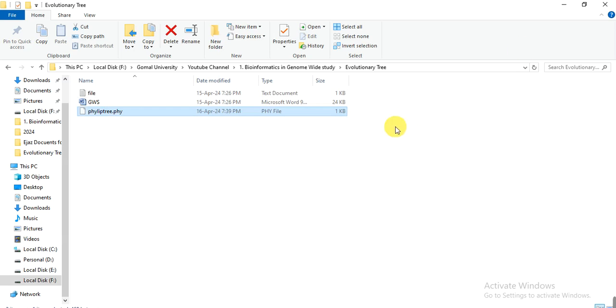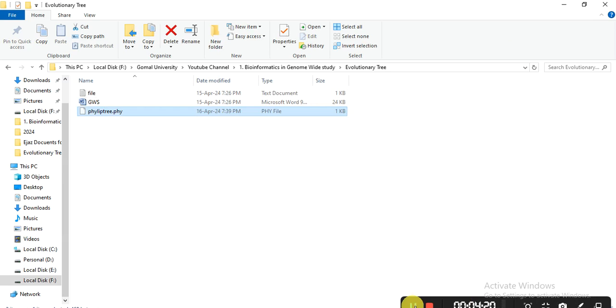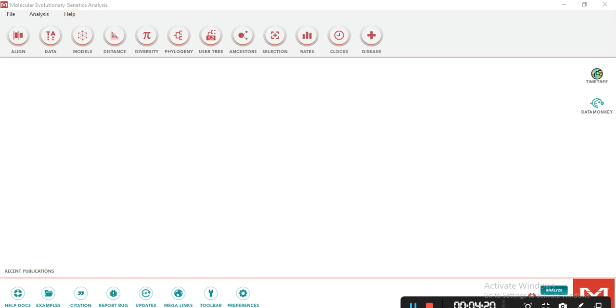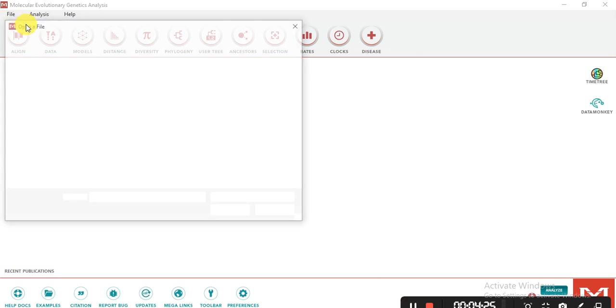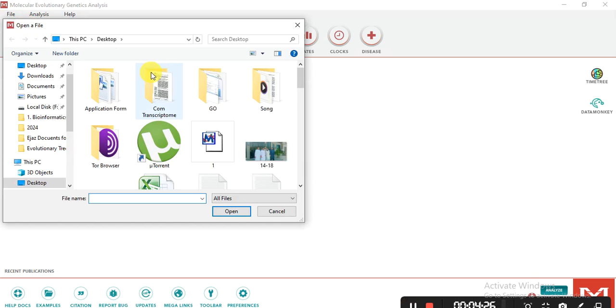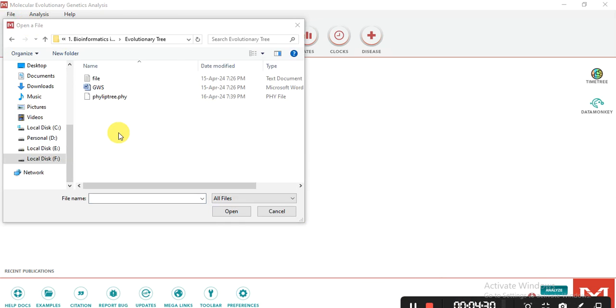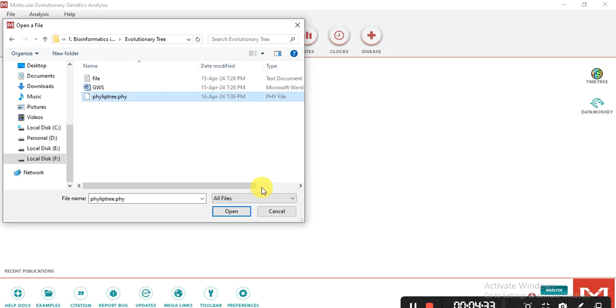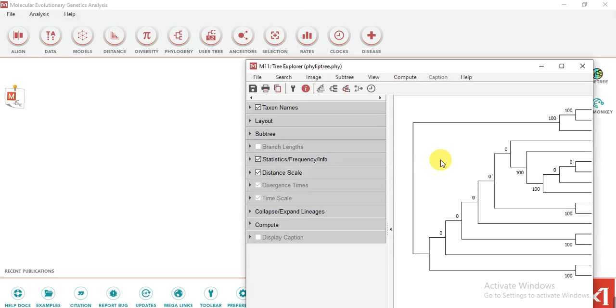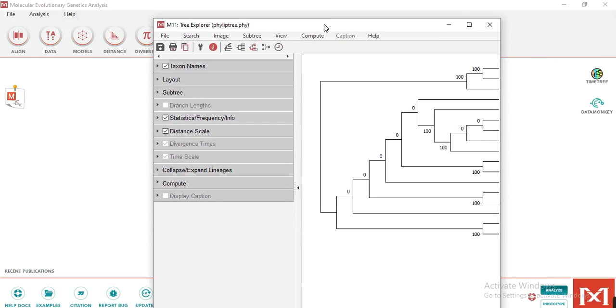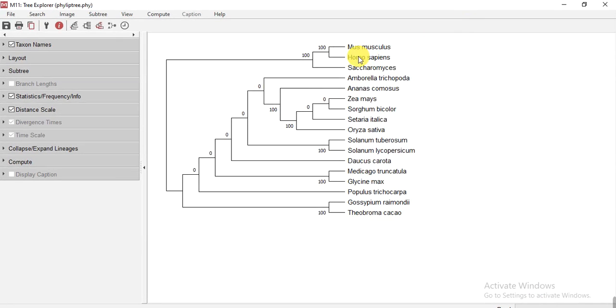Now you need to check and modify this phylogenetic tree. Open the MEGA software. Go to file, open file session, and then open the file that we have just downloaded, this one, phylogeny. So here, our tree file is opened.